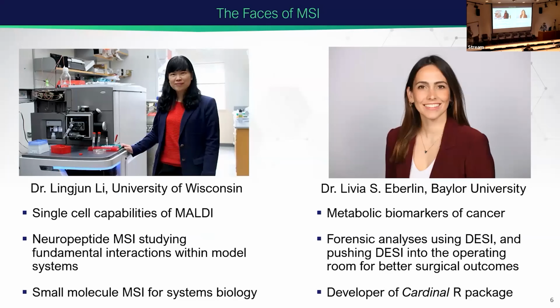So here we have Dr. Lingjun Li from the University of Wisconsin. She's really interested in those single cell capabilities of MALDI imaging. MALDI is a type of mass spec imaging, which we'll cover more later. She's interested in studying neuropeptides and their fundamental interactions within model systems.